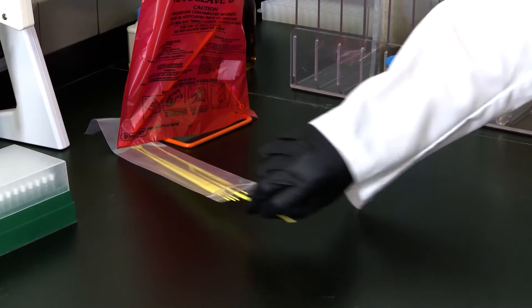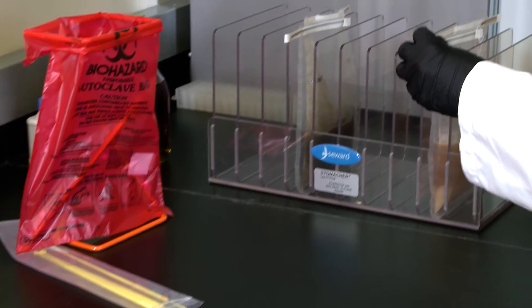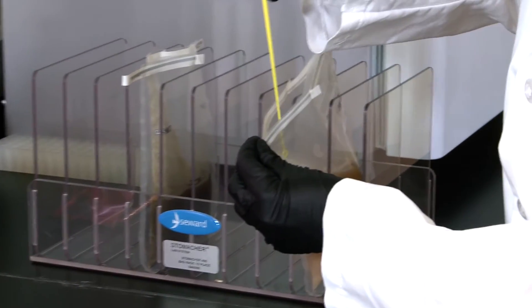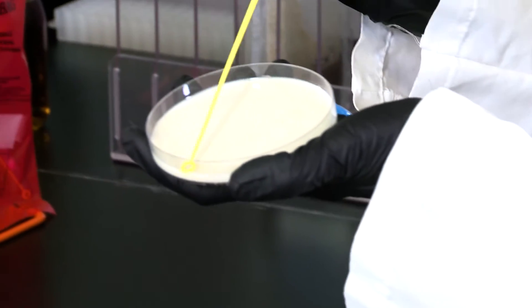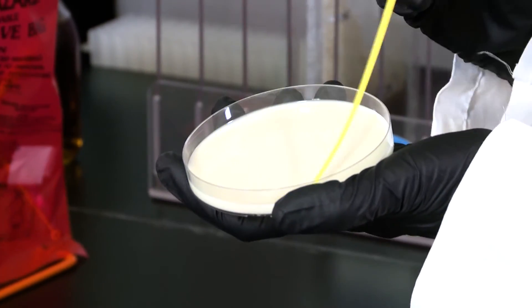First we take 10 microliters of the sample using the calibrated inoculation loop. Place the loop on the outside edge of the plate and streak the sample across half of the agar surface.